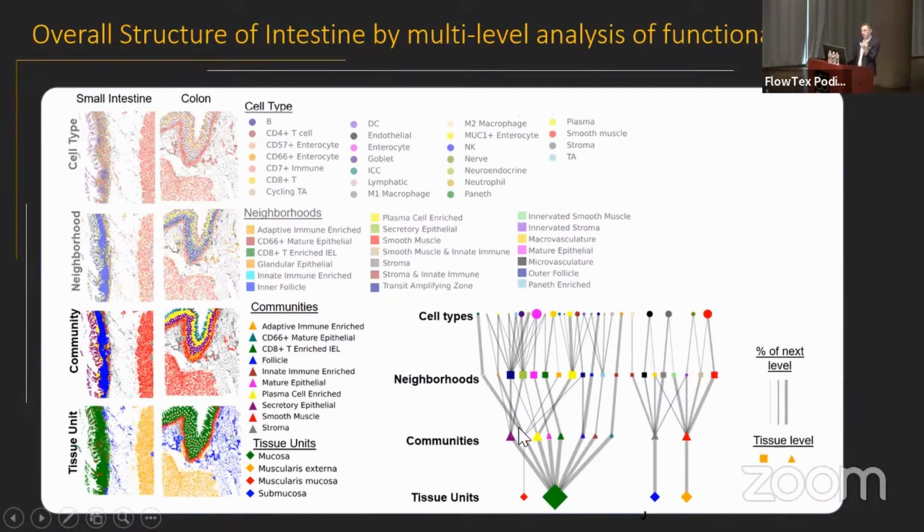And this can tell us about cell-cell interactions. It can tell us about multi-cell module interactions, which is really informative to the biology that's going on. And I'm only going to share one example today because of time, but you really can learn a lot from these type of graphs, even though it's a little complex in terms of the presentation.